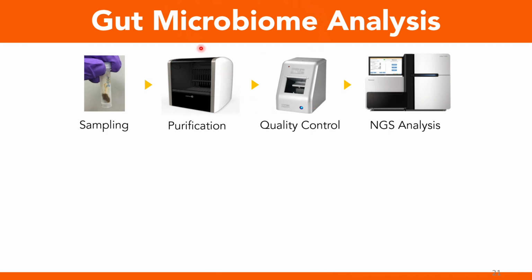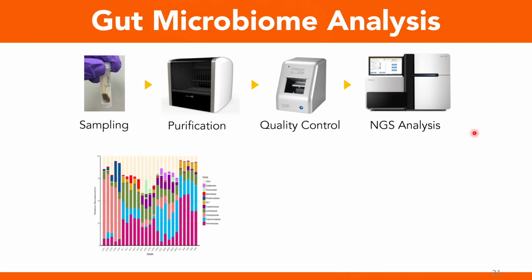We do microbiome analysis, and normally there are 4 steps to do the study. First, we need sampling, then purification, then quality control, then NGS analysis.